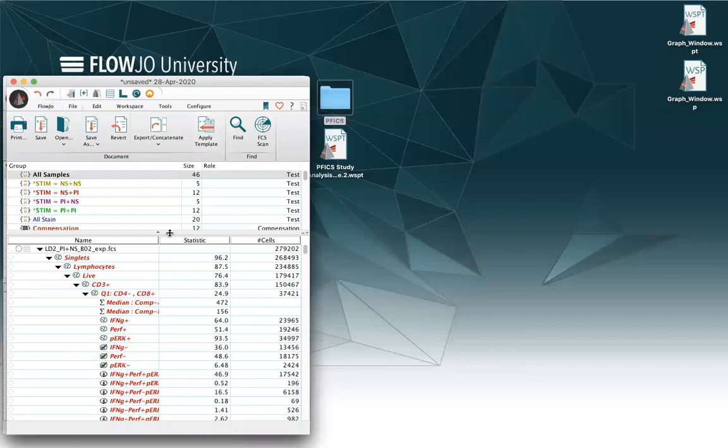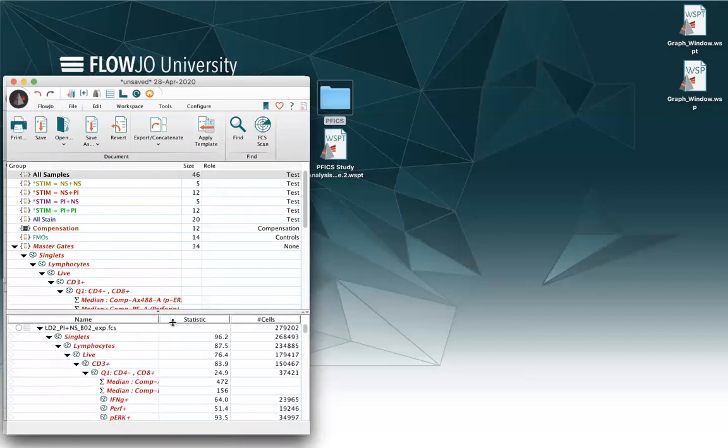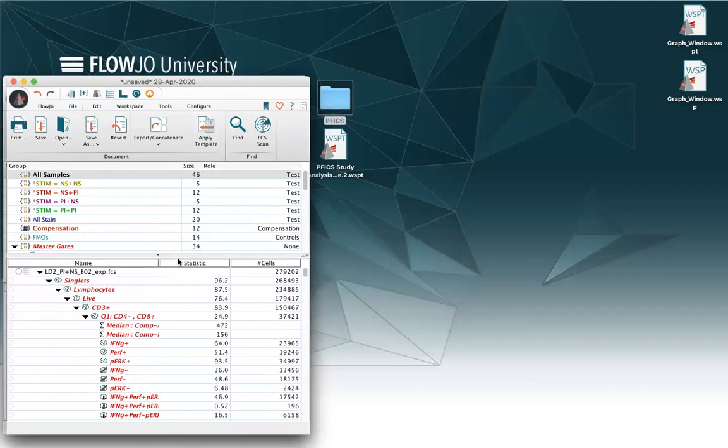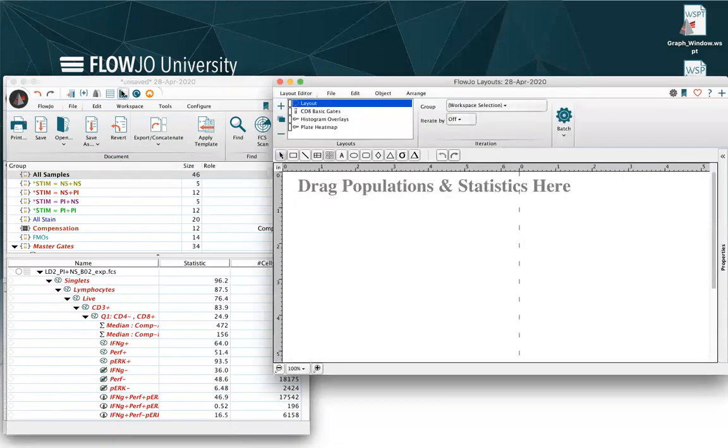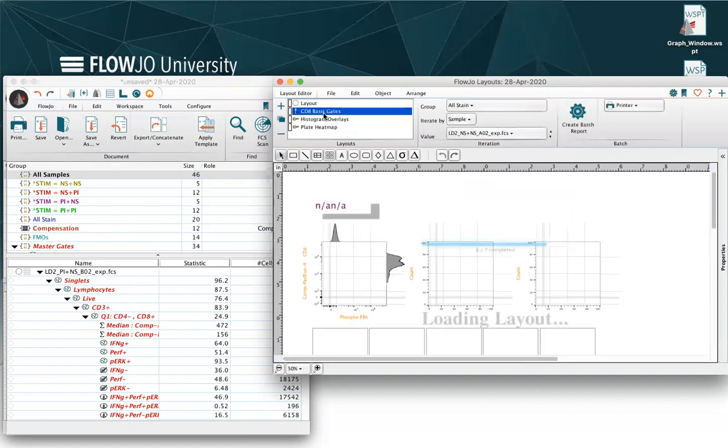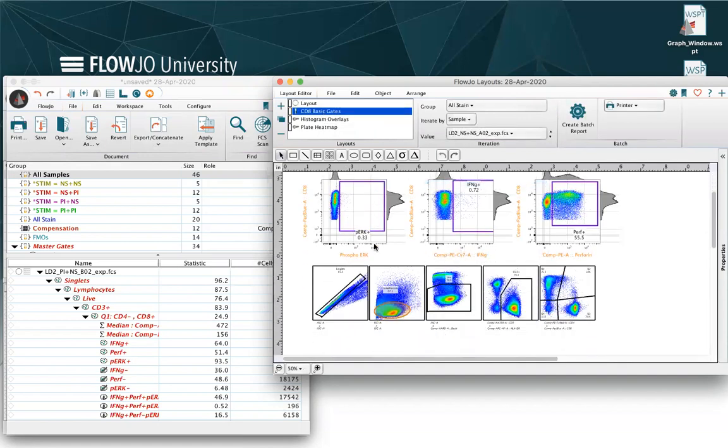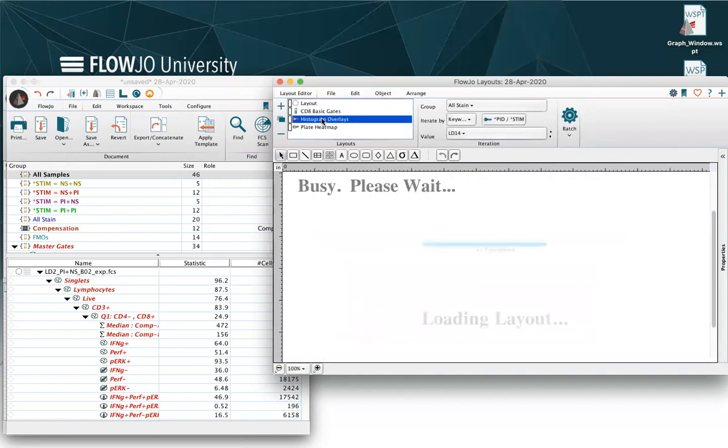We see that all my groups are here, and in my layout, everything will be automatically populated.